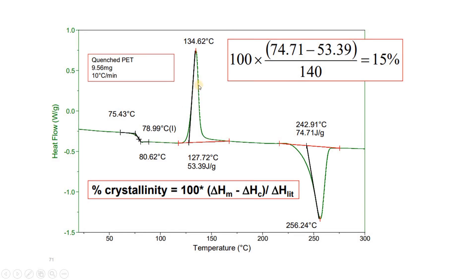As an example, here we have a DSC curve showing both cold crystallization and a melting peak. The calculated enthalpy of melting is 74.71 J/g and the enthalpy of crystallization is 53.39 J/g. We subtract this value per the equation, then divide by the enthalpy of 100% crystalline PET from the standard table to calculate the percentage crystallinity.